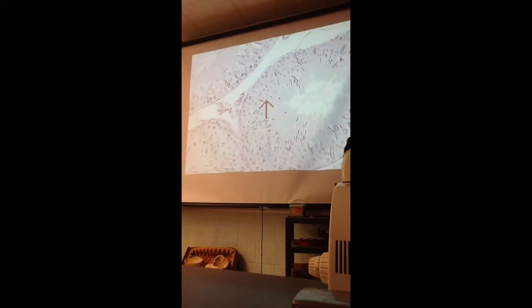Here you have the interstitial cells or the Leydig cells in between the seminiferous tubules that produce testosterone.